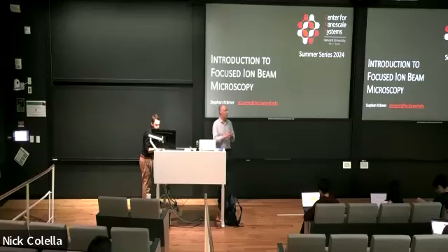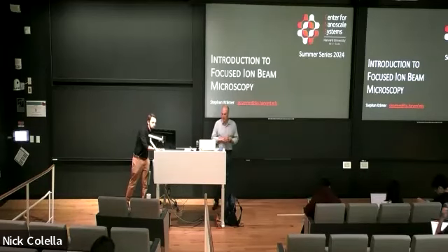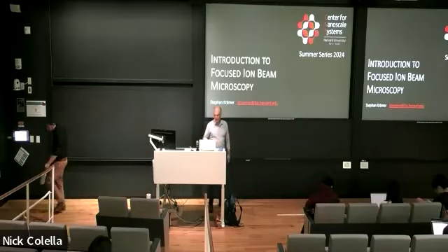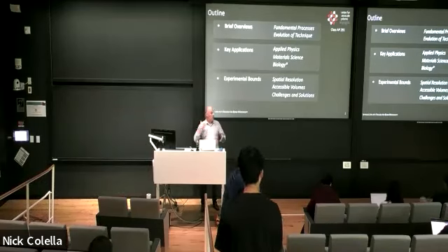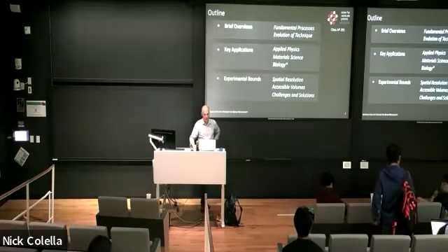So my responsibility is focused ion beam, but I'm working now with Nikki also on cryotransmission electron microscopy. So today I want to try to give you a flavor about what you can do with focused ion beam microscopes. Give you a quick overview about the fundamental processes, maybe a little bit of a history. It's a relatively new technique compared to others that you might be familiar with, but it's a constantly evolving technique, and there's a lot happening at the moment.